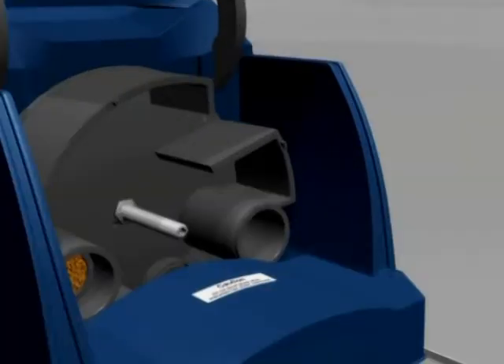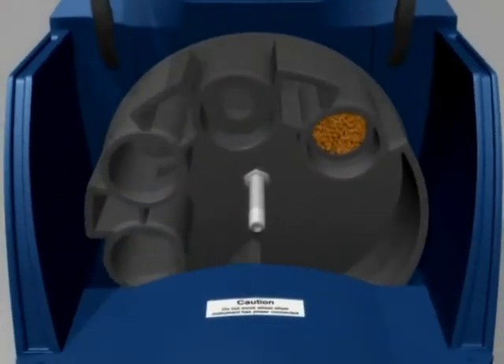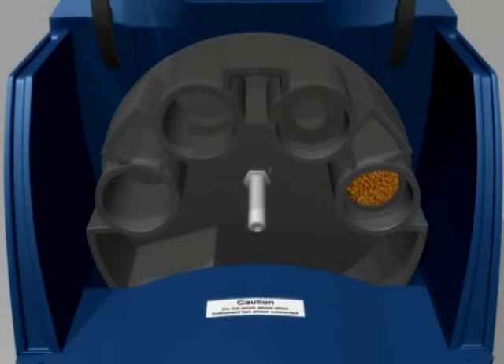As the instrument is not connected to a power supply, the sample handling wheel can be turned manually to bring the four cylinders to the top to make them accessible. The sample wheel should only be rotated manually if the unit is powered off; otherwise gearbox damage will result.